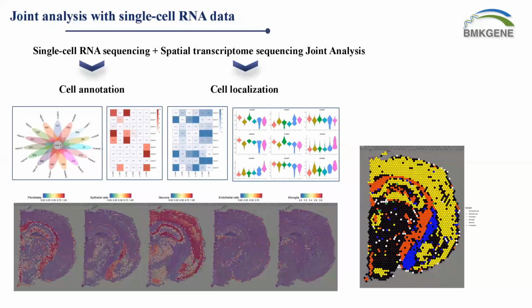Another thing that I would like to emphasize is that we are talking about spatial transcriptome sequencing, and it always happens that people confuse single spot with single cells. If you think of the size that we mentioned in the previous slides, the diameter of the spot is around 50 micrometers, which means that it can contain tens of cells in each spot, or maybe a little bit less.